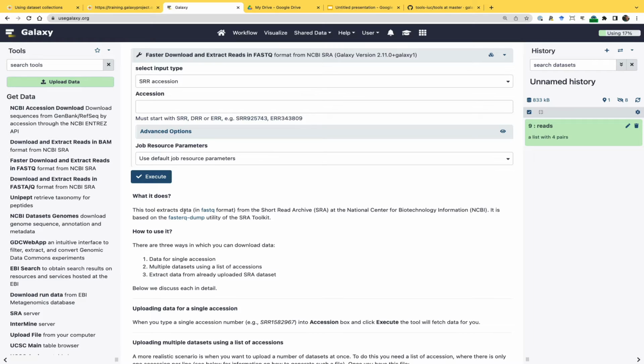Anyway, I'm derailing here. Okay, so let's do something with this collection. It's an old joke, but when you get data from a core facility, the key existential question at this point is to pay or not to pay. And it's all the money. So when you get data from a good core facility, the data is good. But who knows, maybe you get it from somewhere else. So it's probably a good idea to figure out, is my data good? That will be an assessment of a sort. In the case of Illumina data, we can use a tool called FastP.